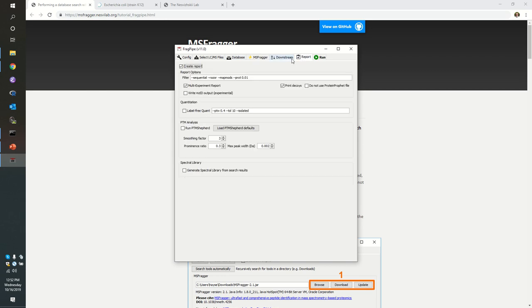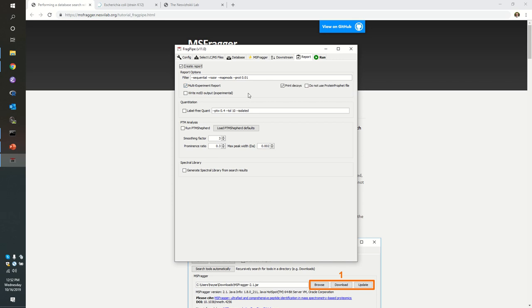We're going to continue on to report. And yes, we definitely do want it to do a report in this case. You should definitely check multi-experiment report, because in this case, we have the 10 different experiments, and we need to treat each of them separately, but conjointly at the same time. We do want to print decoys, because frankly, leaving those decoys in there is useful to us in getting a sense of how many spectra a known falsely identified protein has.